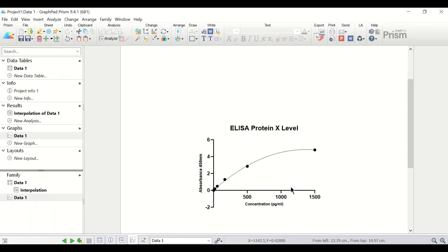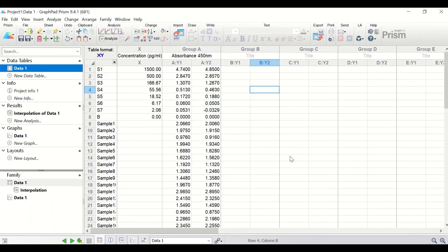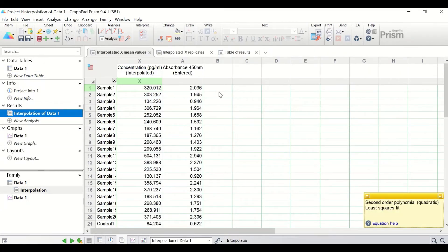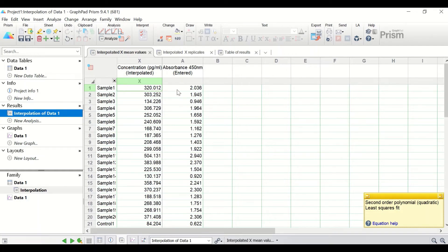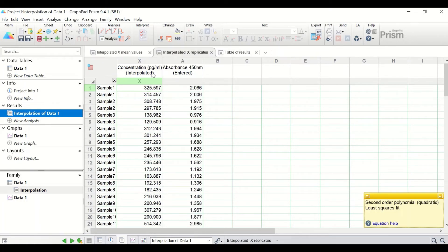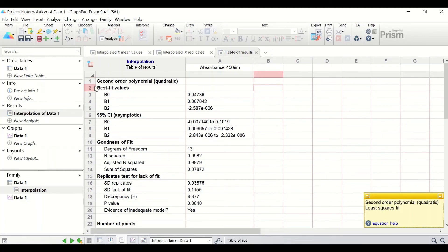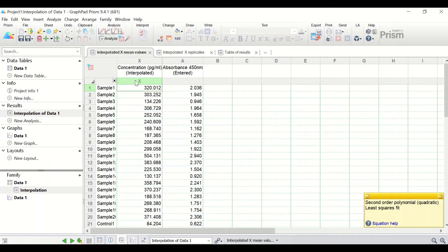Now we have the curve ready, fitting the points for the standard samples. From this curve, the concentration of the unknown samples will be determined. Going back to the data and clicking on the Results section, then the interpolation — three sections are generated. The first shows the interpolated mean concentration for each sample in picogram per ml. The second shows individual sample concentrations with absorbance. The third is a results table confirming the curve was fitted using second order polynomial quadratic, with a goodness-of-fit R² of 0.99.